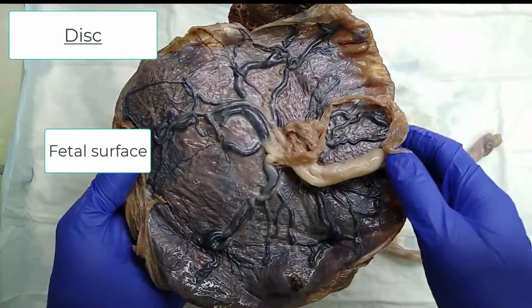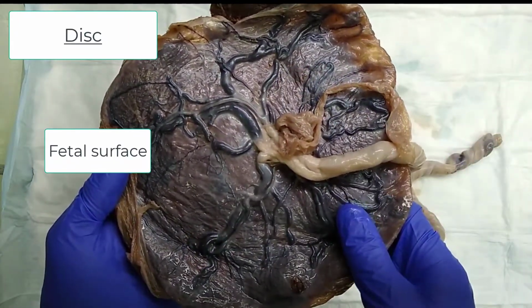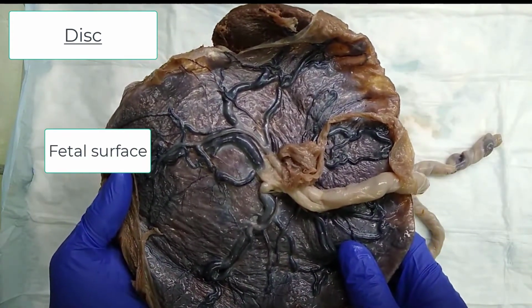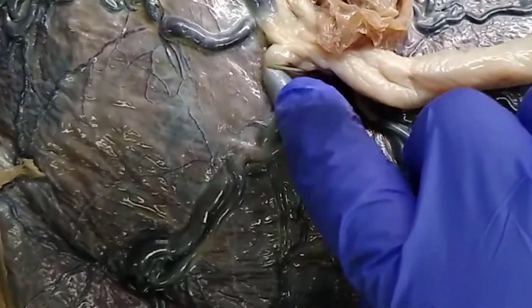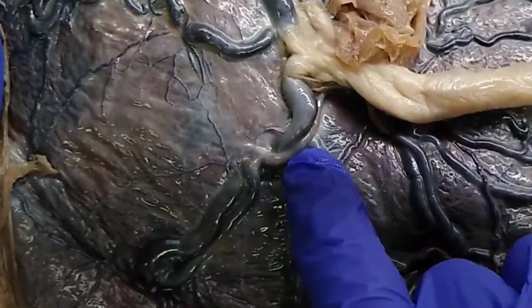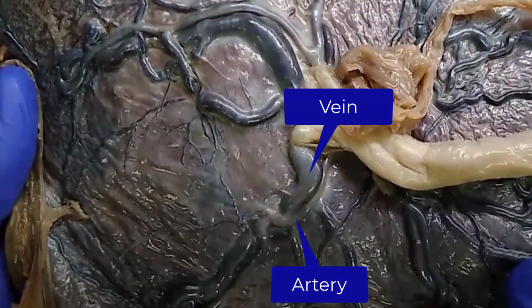The vessels include arteries and veins, and generally the arteries run over the veins, and that's how we can tell the difference. So right in this area here, this is a large vessel, but it's actually running underneath this vessel. So the larger vessel is a vein and the smaller vessel is an artery.